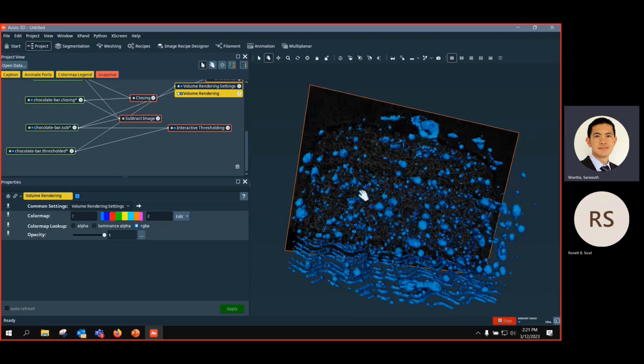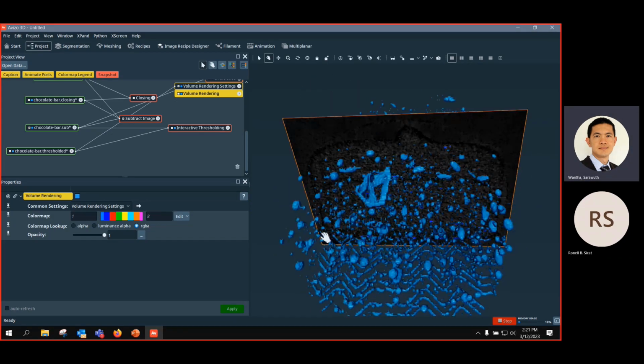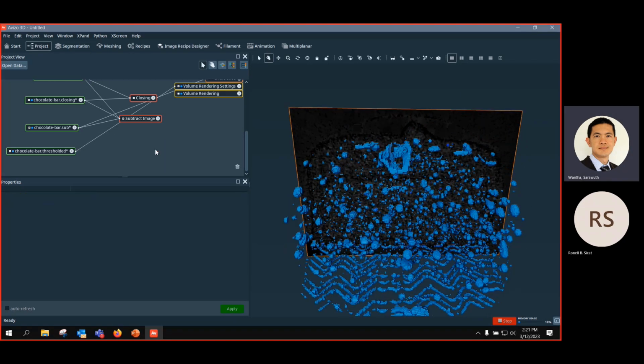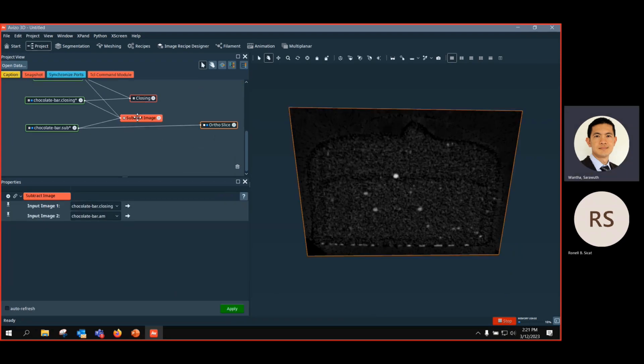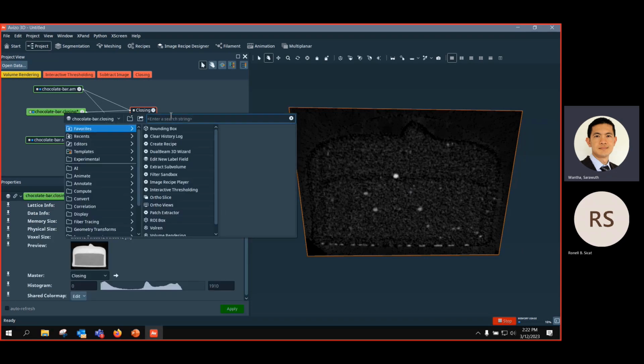So that you don't have to do border queue, you just use interactive top hat thresholding. And before we go to top hat, I just go back to this subtract image once again. Because we use subtract image, you get this result. So instead of using subtract image, you can also use arithmetic, the same thing. You attach arithmetic to the closing image.